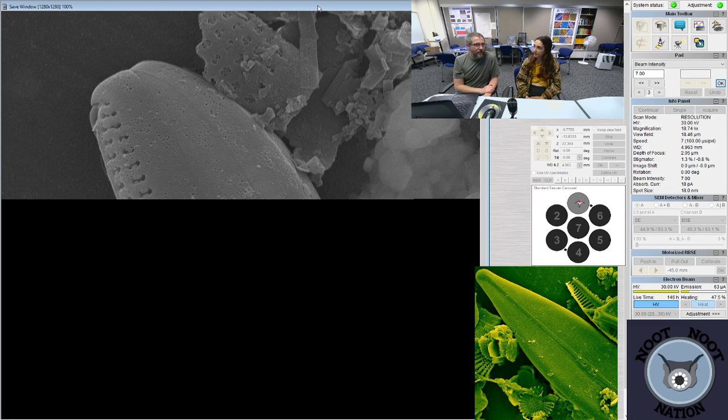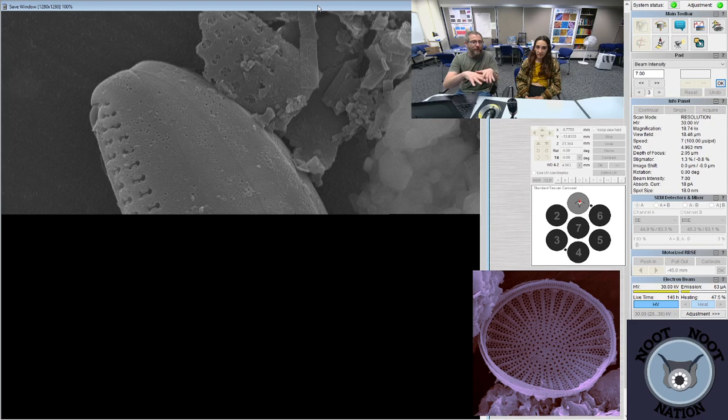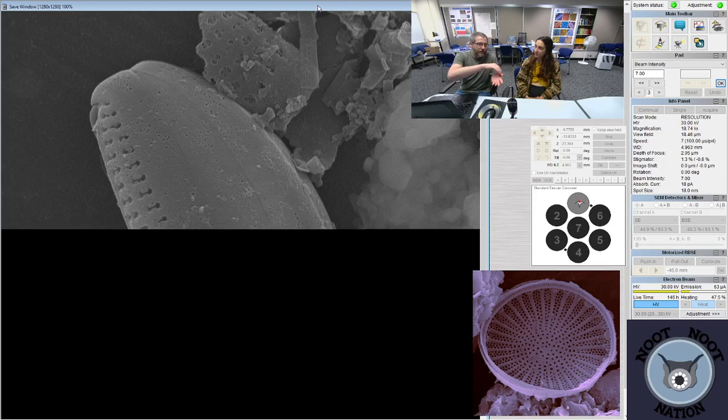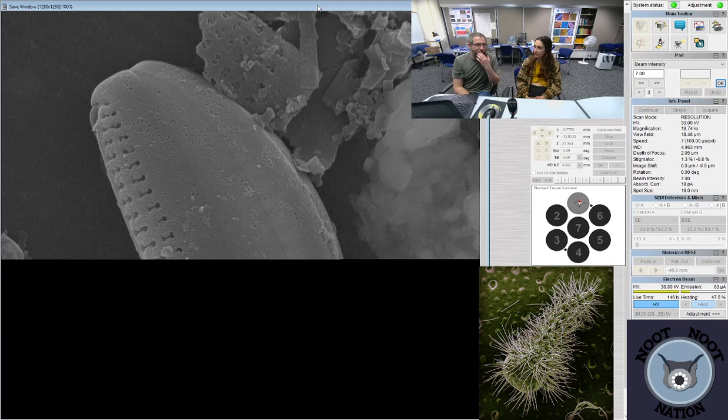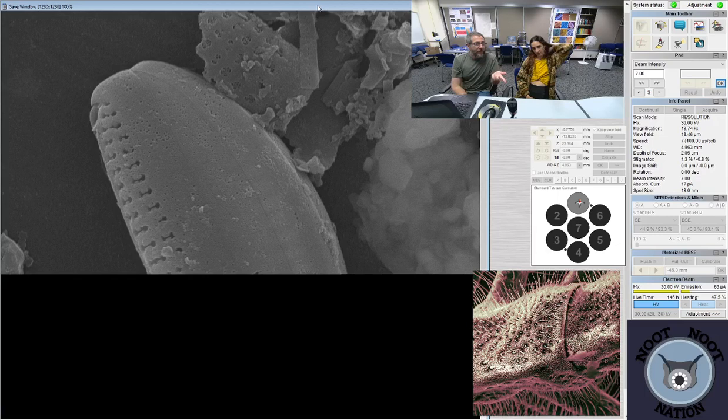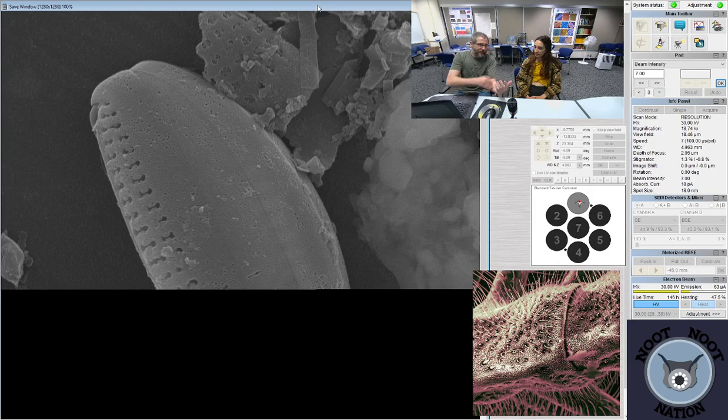So rather than building up a big charge... What would happen if you have a whole bunch of electrons in one area is that when the scan comes across that point, it will look really bright. So all the edges would look really bright, and probably it would cause a bunch of artifacts. Like we sometimes see lines that go across the screen where it's charged up. Or if a diatom is not sitting completely flat on the stage, like sometimes they're standing on their edge, like they land like a coin.